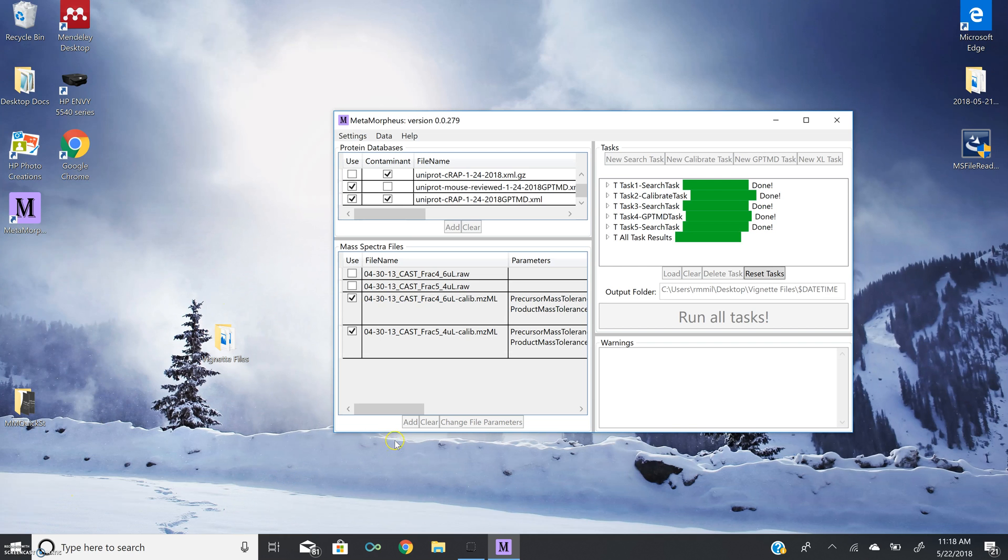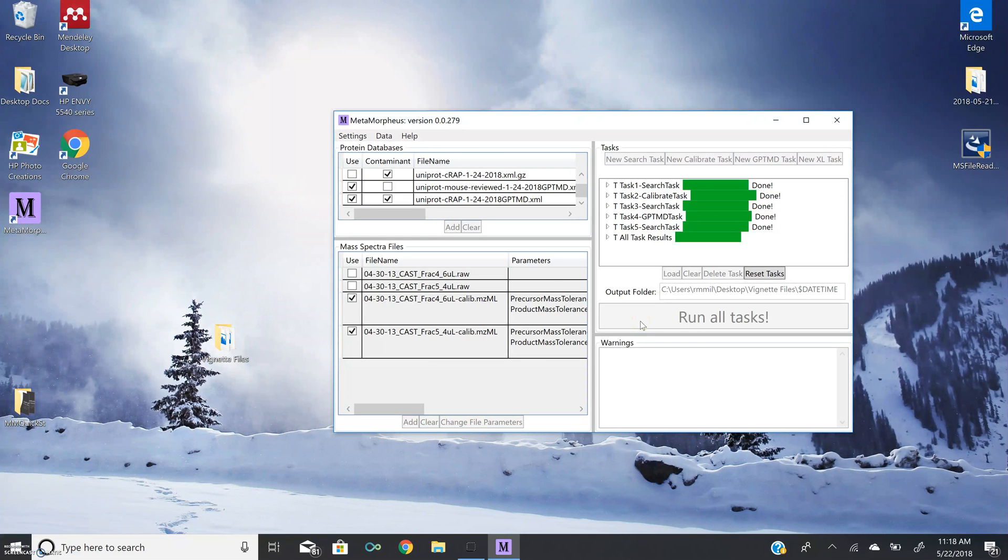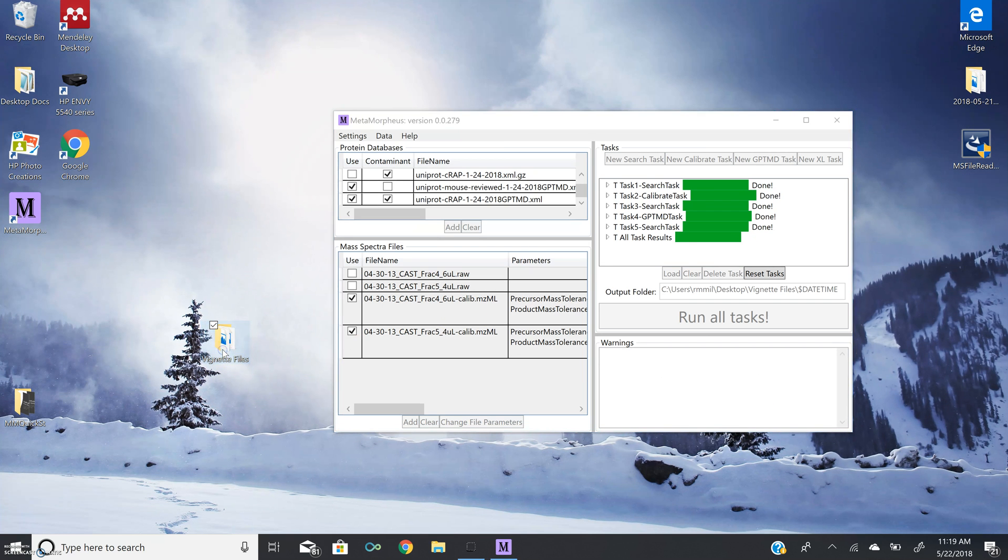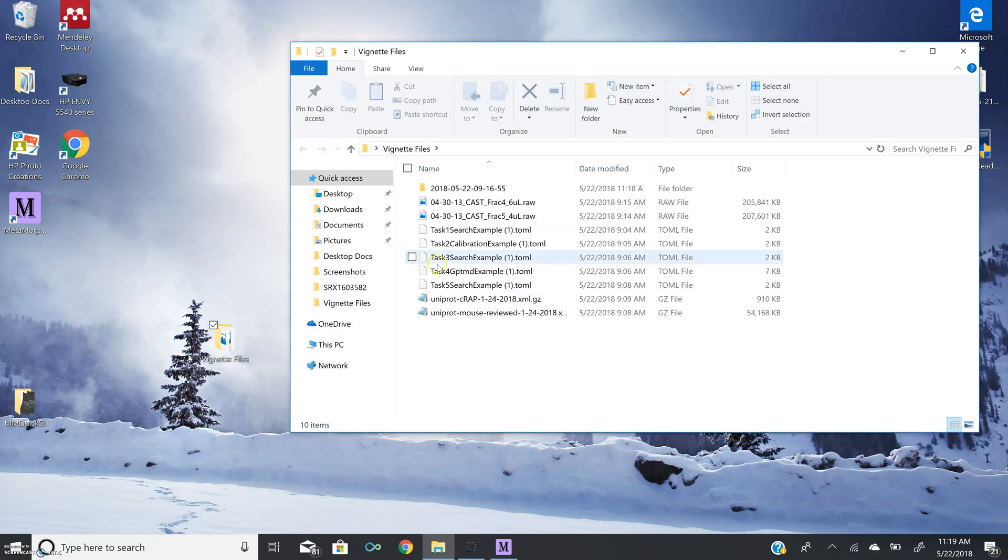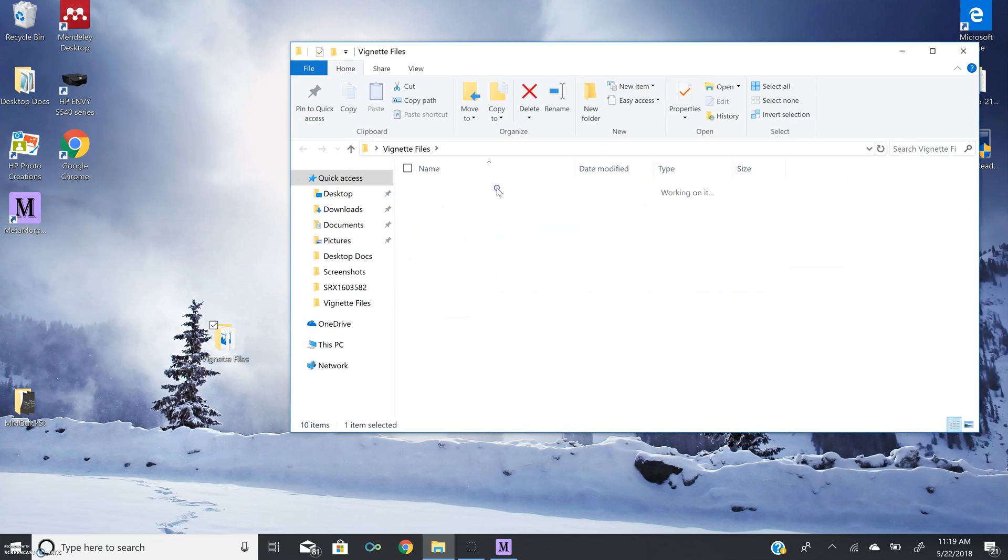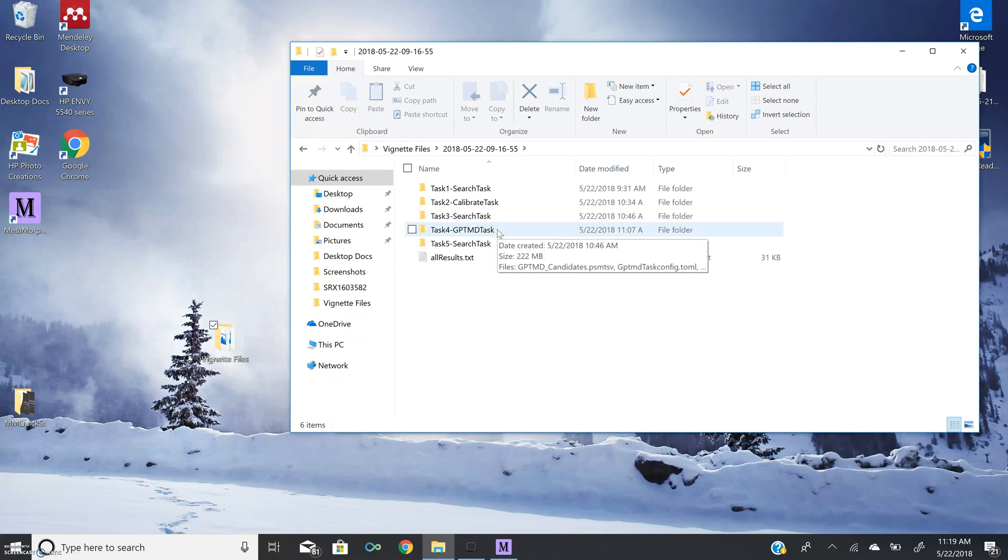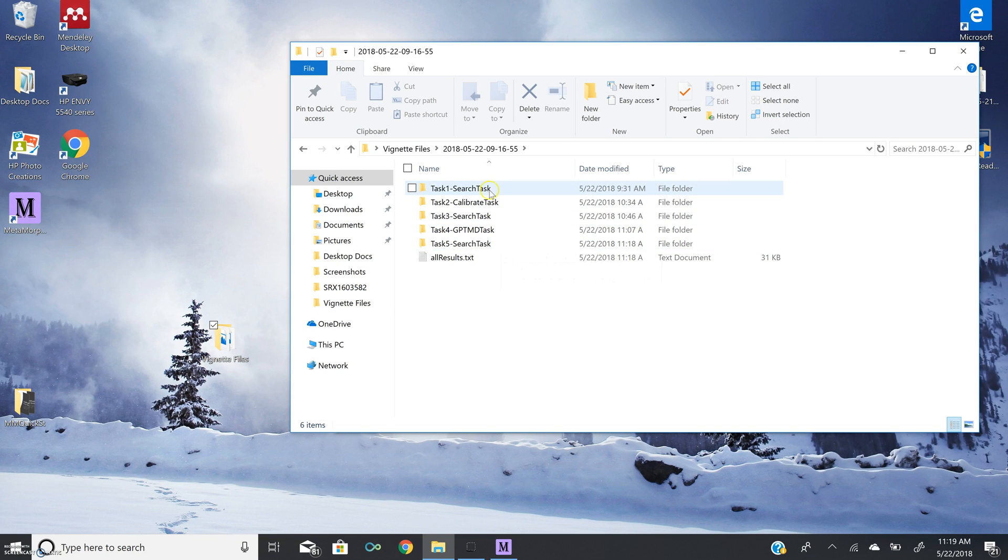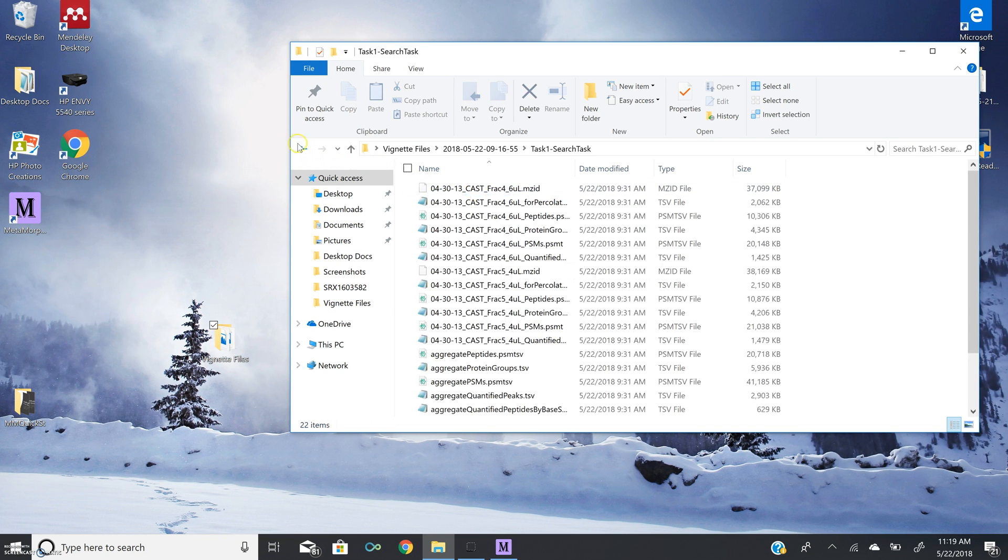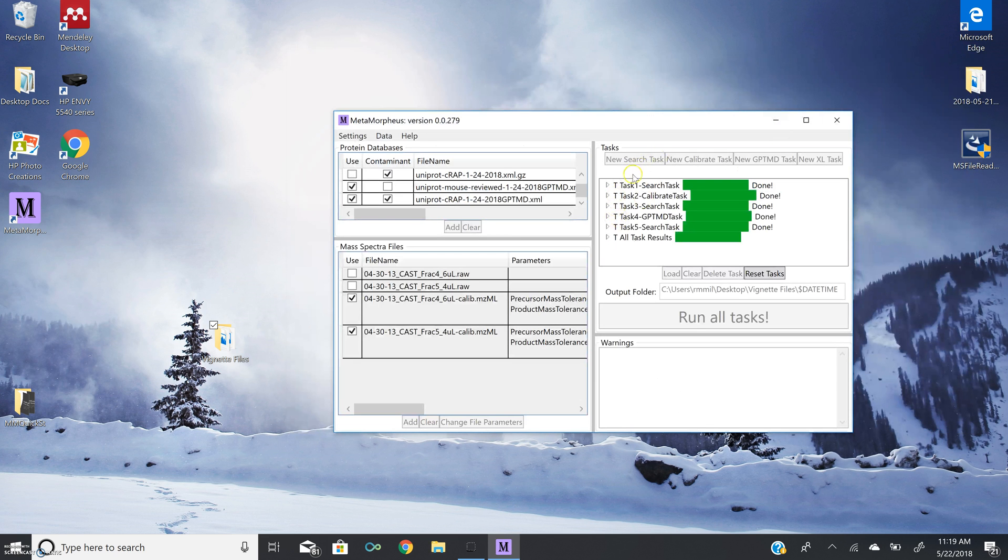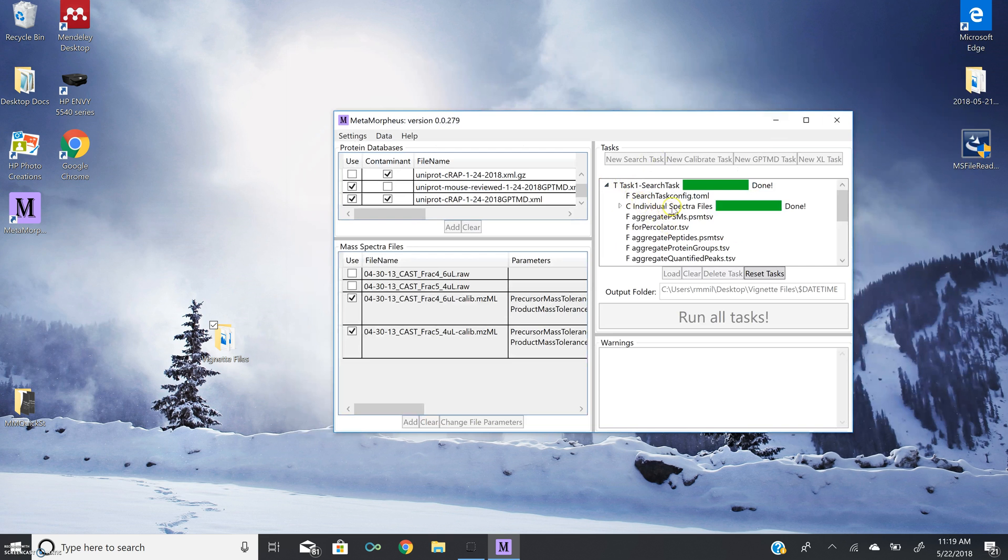All right, so as you can see here, all of our tasks have completed successfully, meaning we have properly installed Metamorpheus. Now if you wanted to look at the results of your searches and various tasks, you can find that output in a folder labeled as the date and time in the location where the first spectra file was from. This means for us that it's going to be in vignette files with today's date and time. And I have my search task, calibration task, second search task, GPTMD task, and my final search task. And all the results are in each of those files. You can also click on this little arrow for each task and see what was done and completed and what files will be in your output folder.